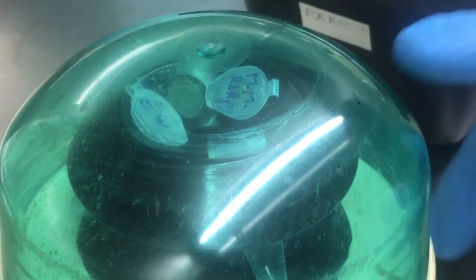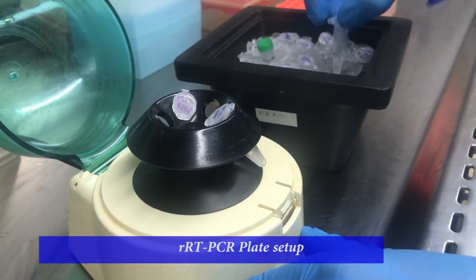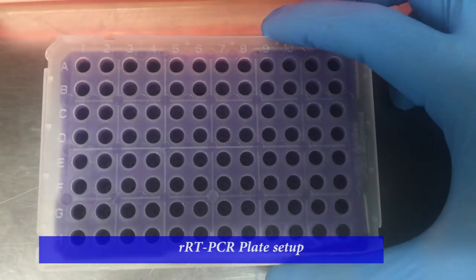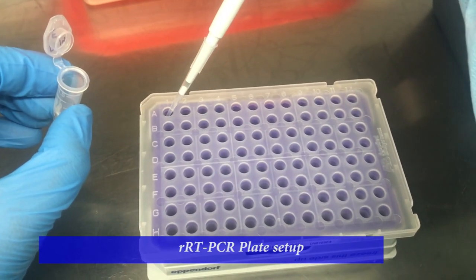As the probes are light sensitive, the master mix preparation and aliquoting on the plate should be carried on with the biosafety cabinet lights turned off. However, keep the room light on.